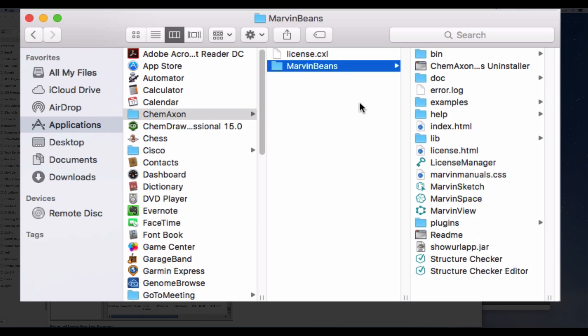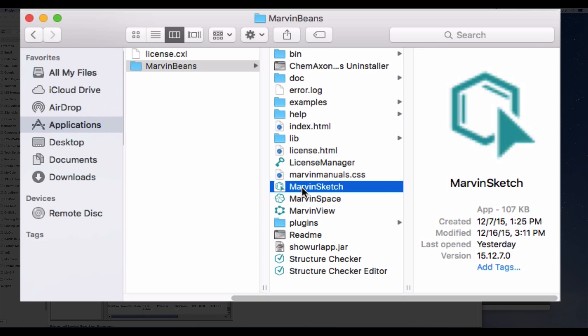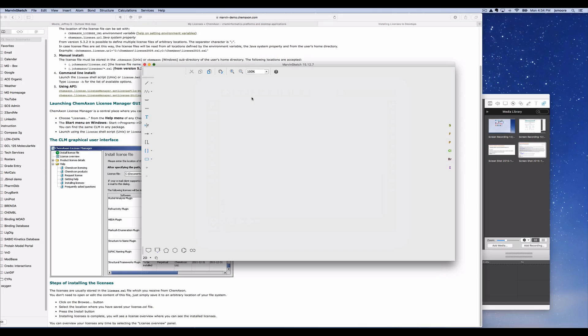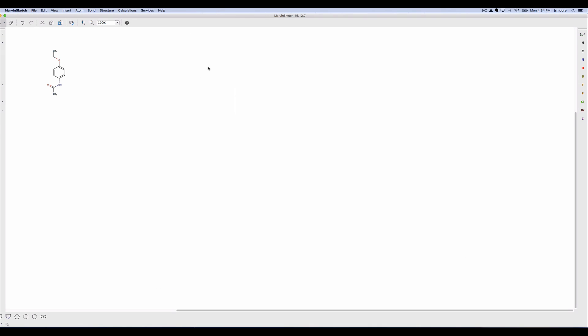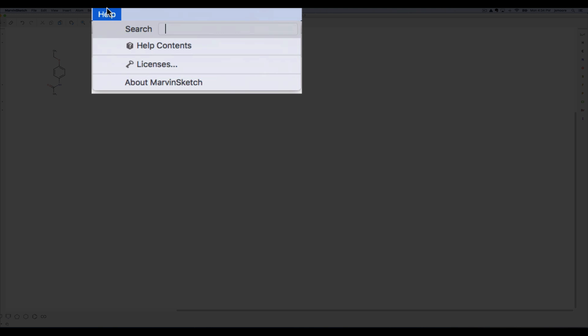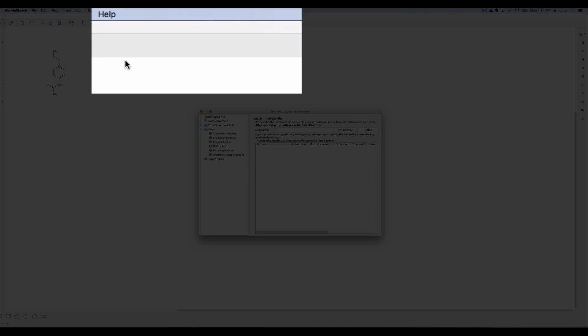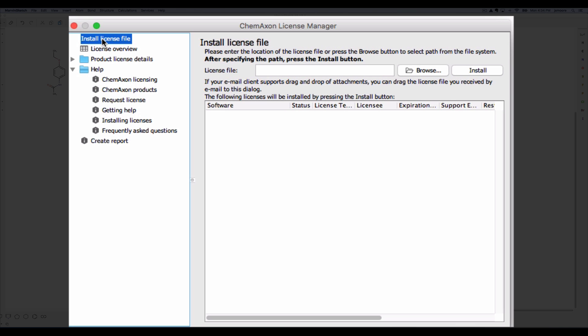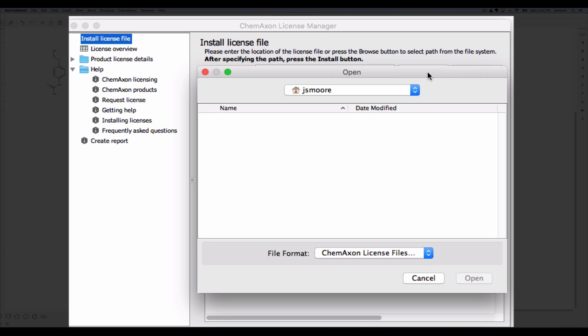Launch Marvin sketch. I had the application running already and a molecule was on the drawing canvas. The help menu will direct you to the license management function. Use the browse button and navigate to your license file.